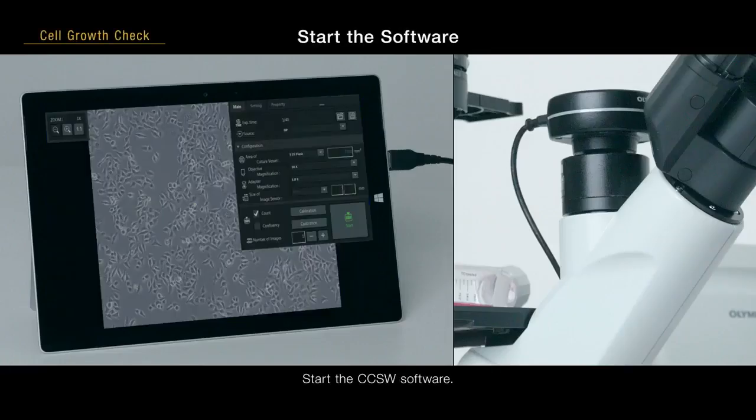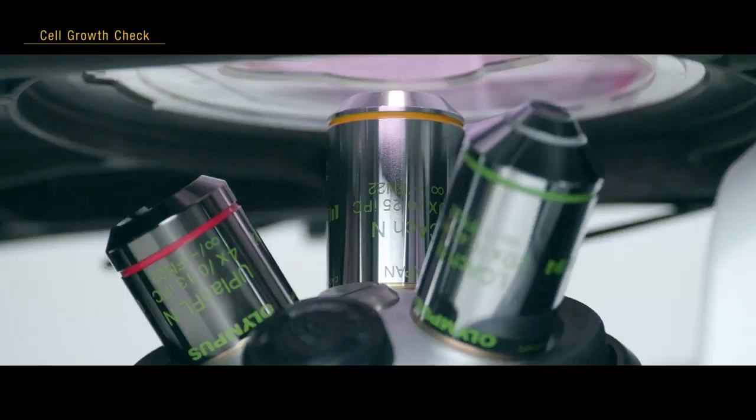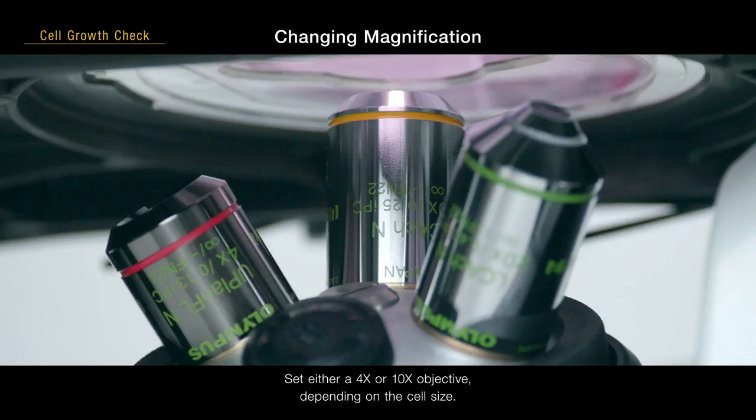Start the CCSW software. Set either a 4x or 10x objective, depending on the cell size.